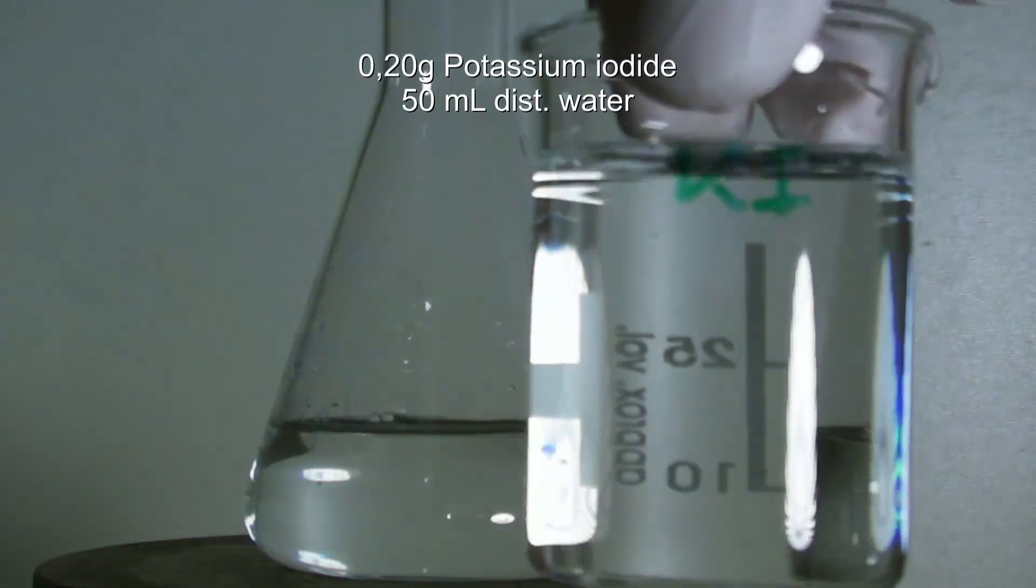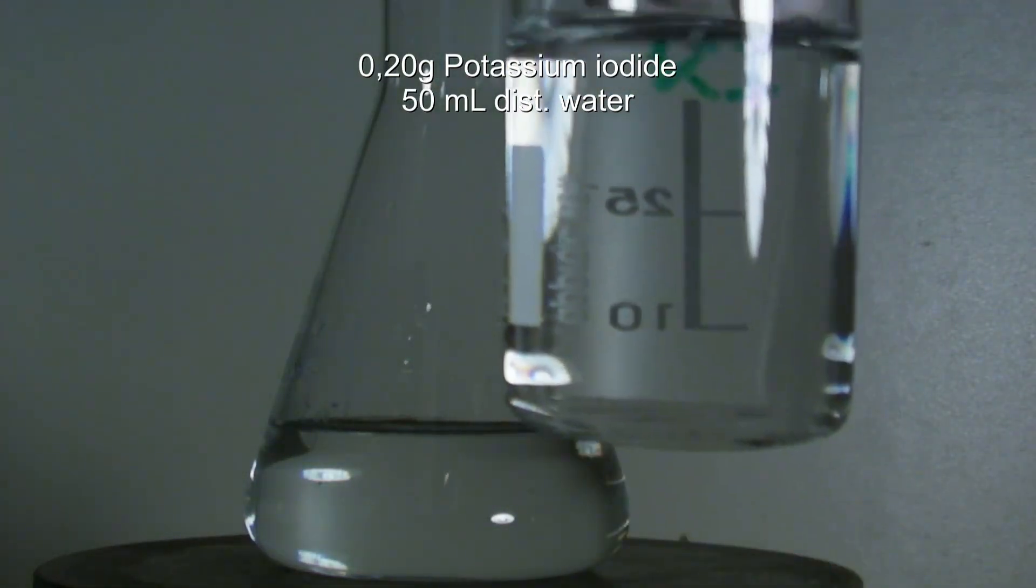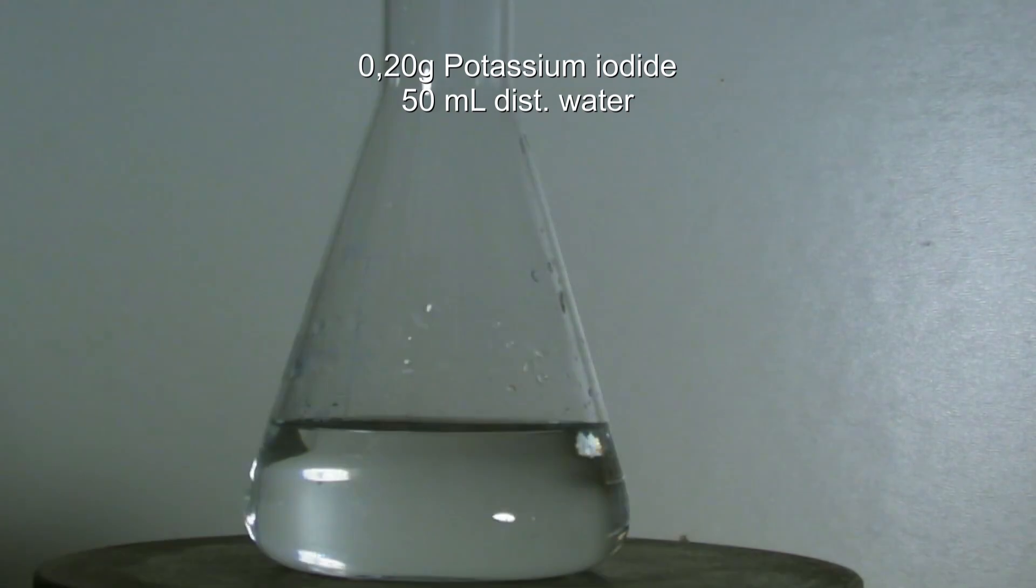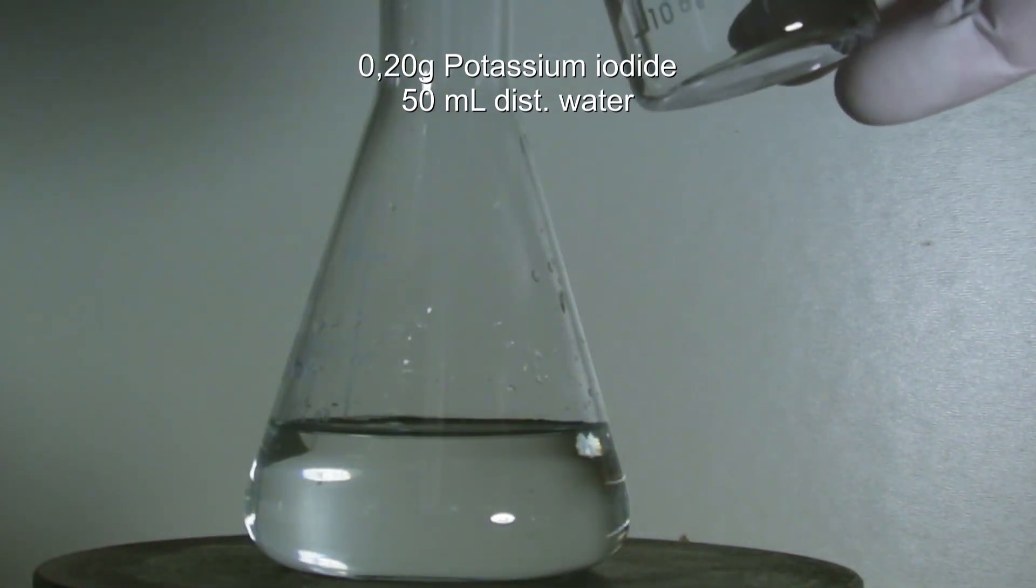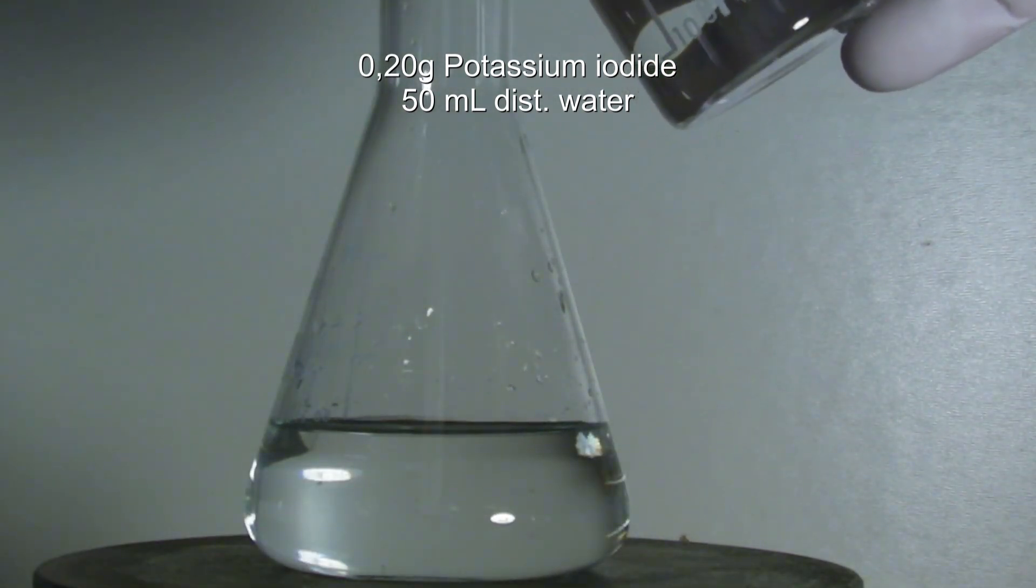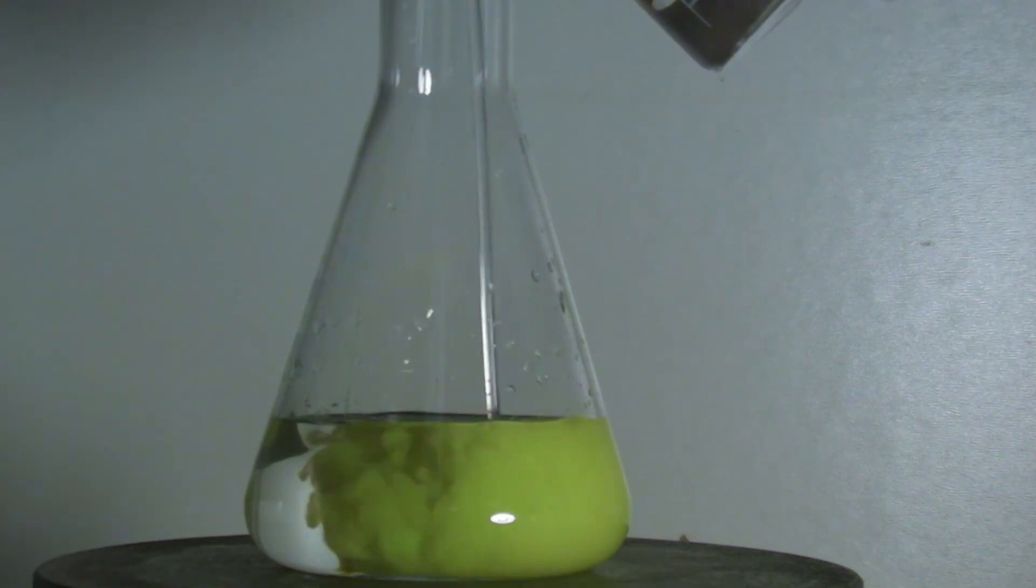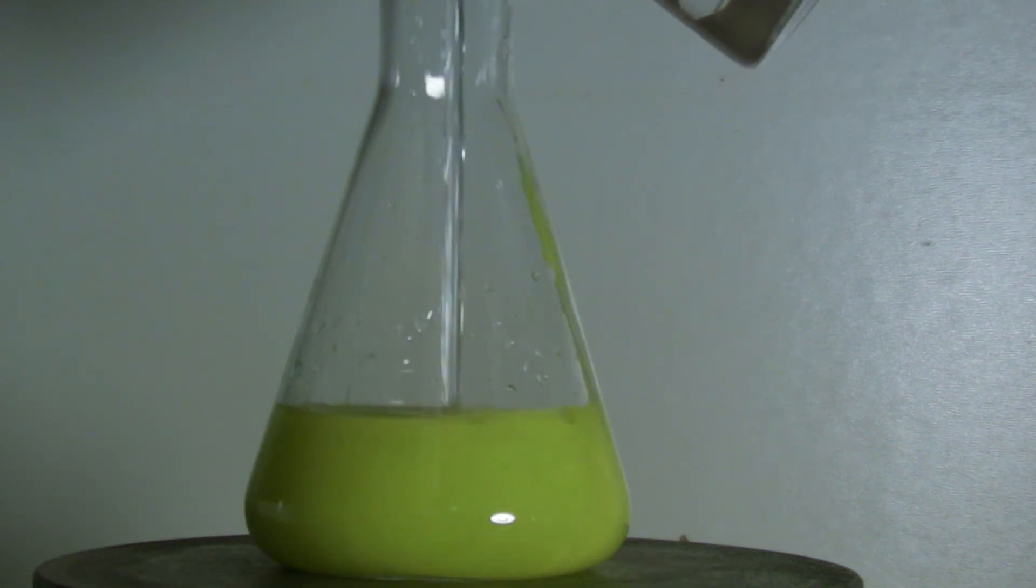Then a solution made of 0.2 grams of potassium iodide and 50 milliliters of distilled water is added. At this point, another 10 milliliters of water could be added because it was needed later on.